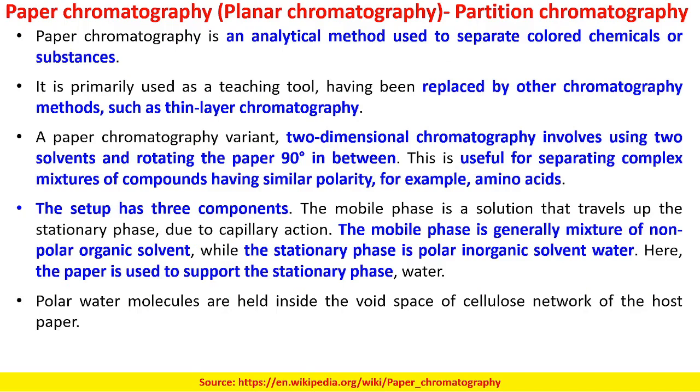Now, next we get into the chromatographic techniques. The first technique is paper chromatography. It is a type of planar chromatography, and herein partition takes place, so it is a type of partition chromatography.